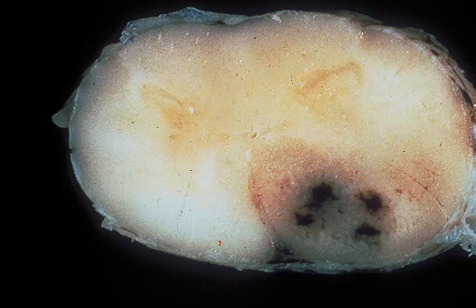Okay, time's up. We're looking at a cross-section of a spinal cord, which has probably been at least partially fixed. You can see the outline of the gray matter with the dorsal horns, the ventral median fissure right here. And in this quadrant, we have multifocal to coalescing necrohemorrhagic leukomyelitis. If you want to say hemorrhage and necrosis of the white matter tracts of the spinal cord, that's fine too. Remember, this is hemorrhage. Whenever we see hemorrhage, we want to think about necrosis.